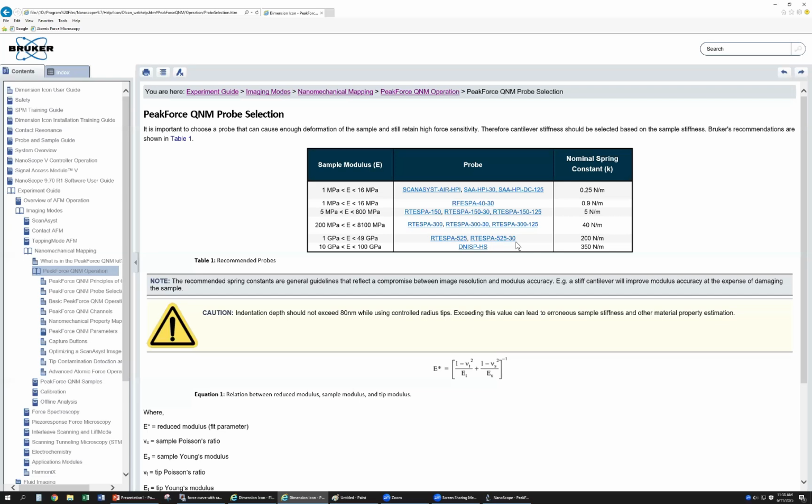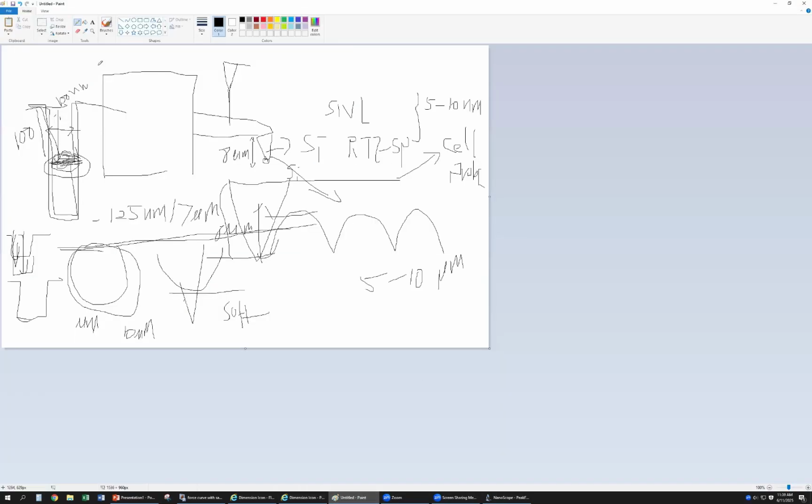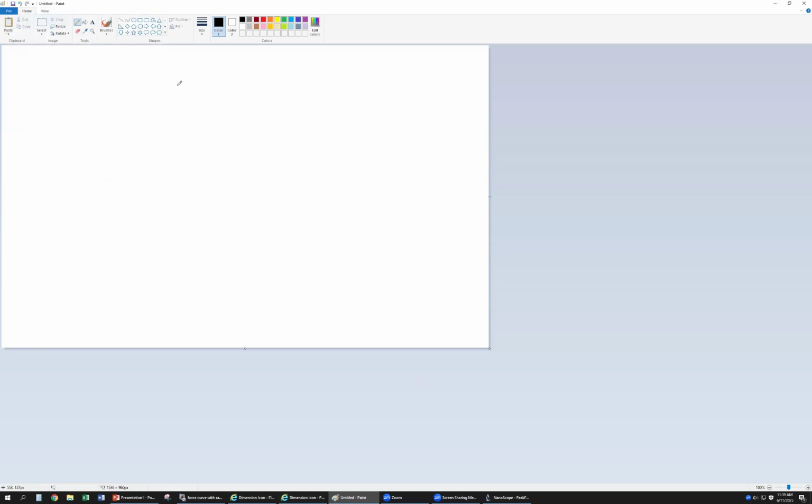如果你用的是这个，然后测出来的数据是其他的，那就稍微预测。 不看这个，看力曲线，看有没有压入深度。 有压入深度，你看有的时候你的压入深度你会去看的时候，so for the first curve 如果你没有压动的话，你的转到 separation 的时候，这是一条直线，它是这么直的这么下来的，这个地方是个0，所以在that means no indentation depth.